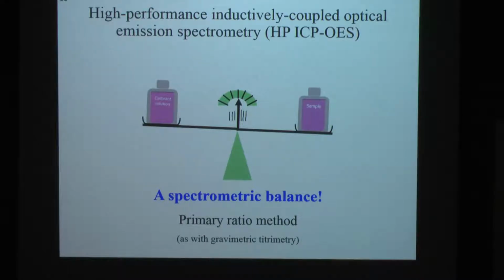A balance is checking one mass against another. If you go home and weigh yourself on a balance, they say there's no standard mass there. You just stand on it and it measures your mass. Well, the thing is they had to calibrate that scale, you might call it, that balance, with a standard mass. And the manufacturer did that. And that standard mass, they've got to check it with some house standard mass that eventually goes back to the standard mass of the weights and measures of the given state, goes back to the NIST platinum iridium number 4 or number 20 through an unbroken chain of measurements, each of which has a stated uncertainty. That's traceability.